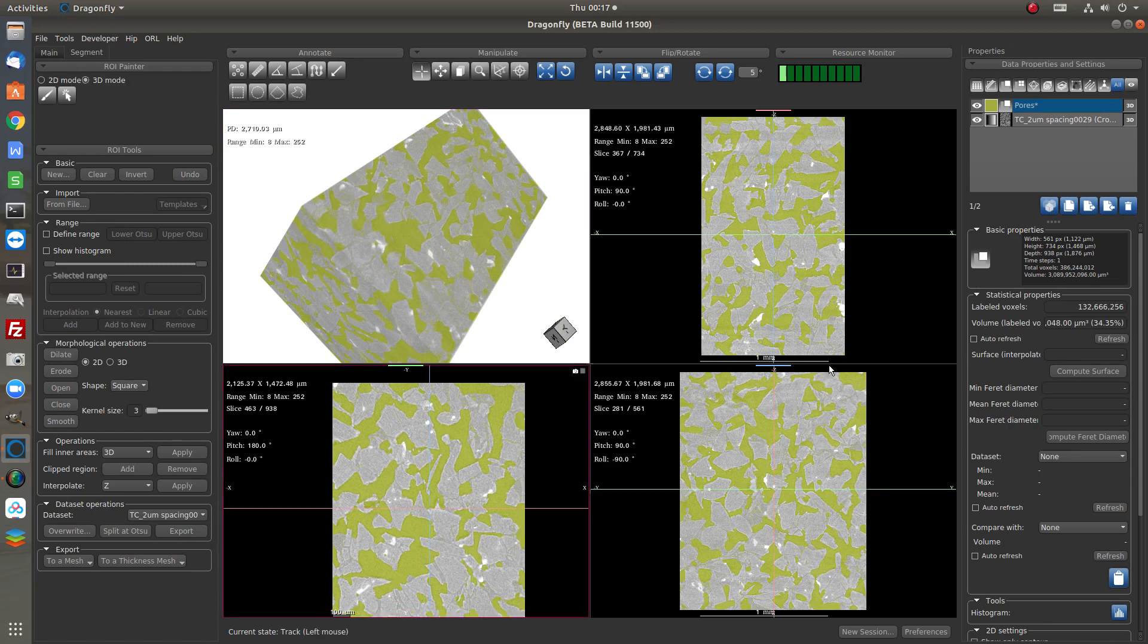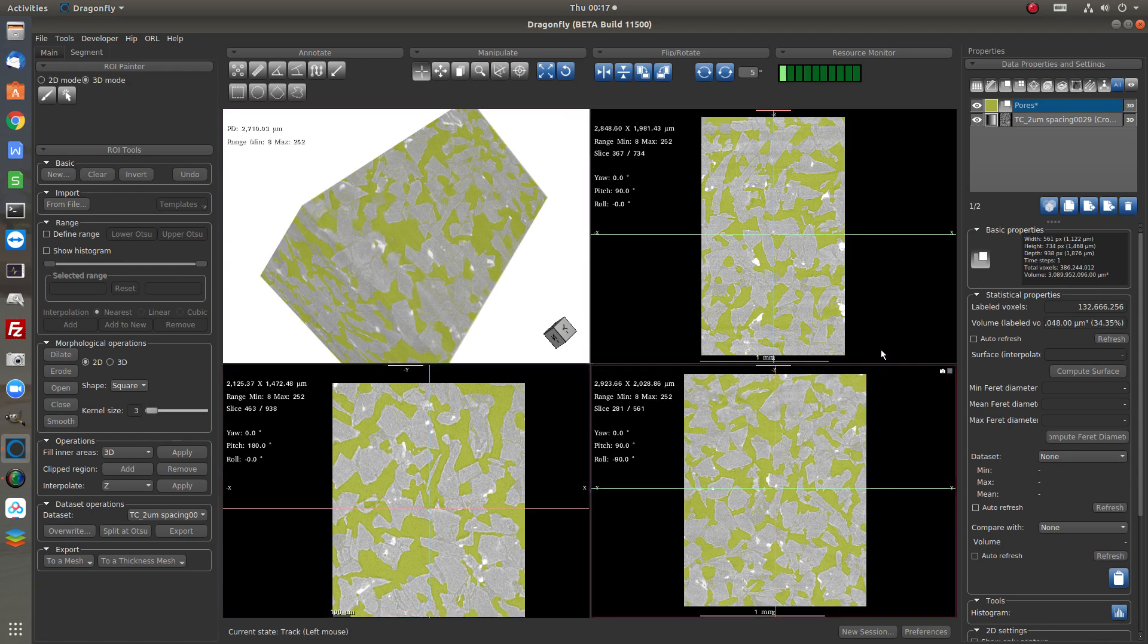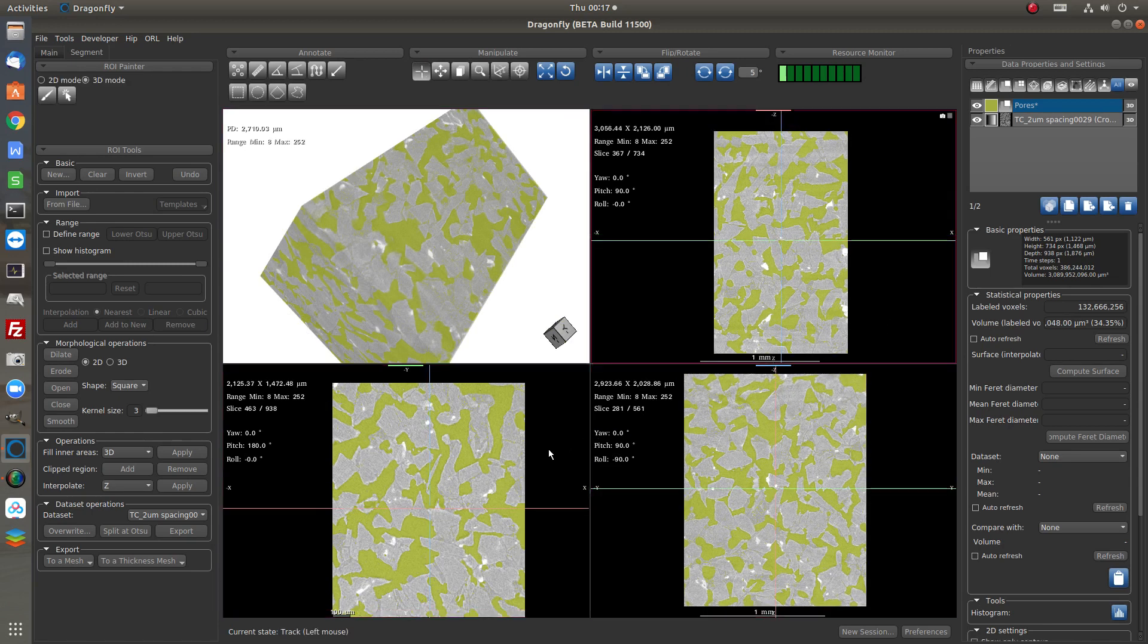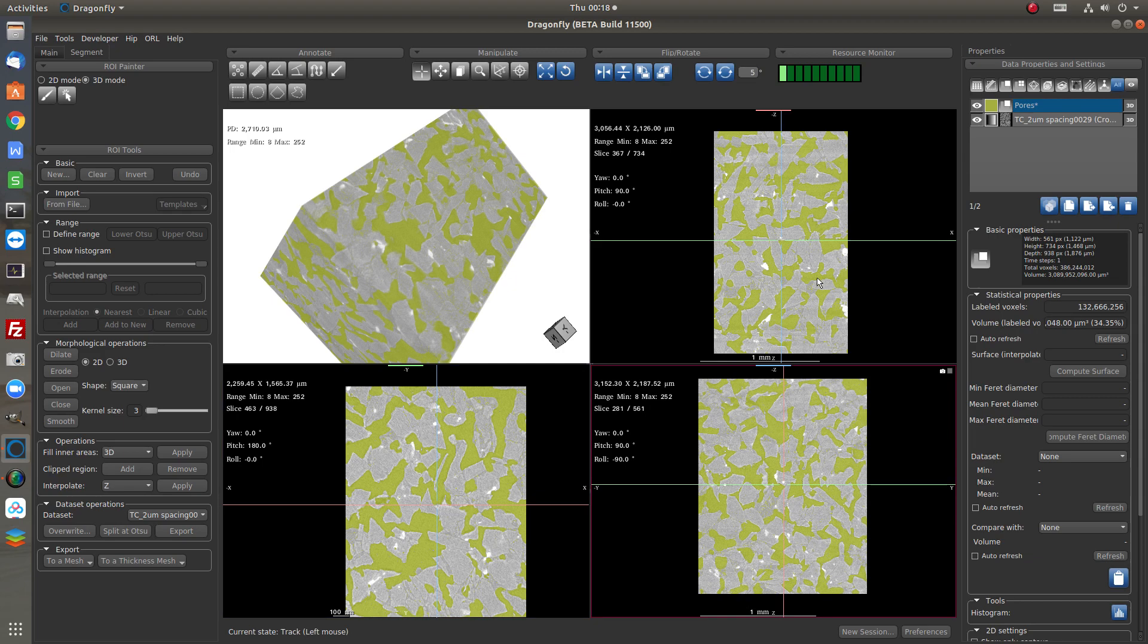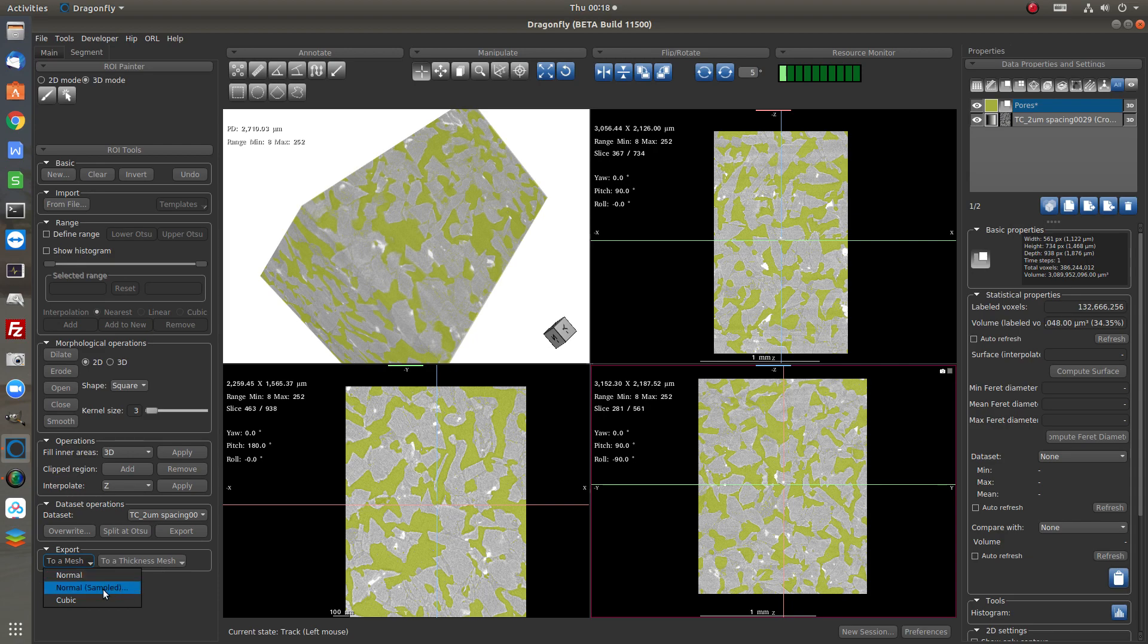So another way to visualize the pores is to convert the ROI to a mesh model. So here export mesh. Now this mesh is quite big so we use the sampled mesh.